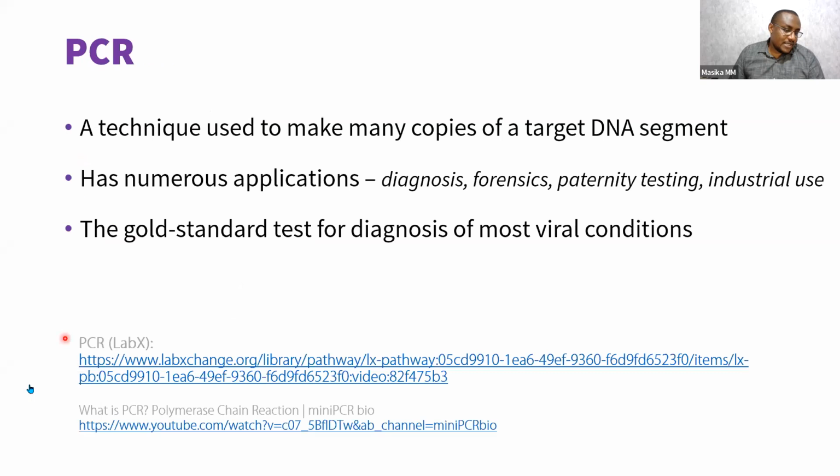I would like to re-emphasize here that a PCR allows us to target a specific segment or section of a DNA and make copies of it. And making copies of it allows us to visualize. So the visualization can be what we call endpoint, which is on a gel. I'll show you what a gel looks like. It was actually in the video, but we'll look at it again. And you can also do it in real time.